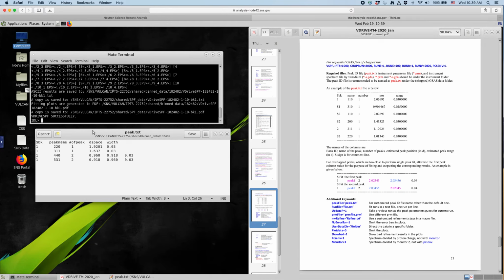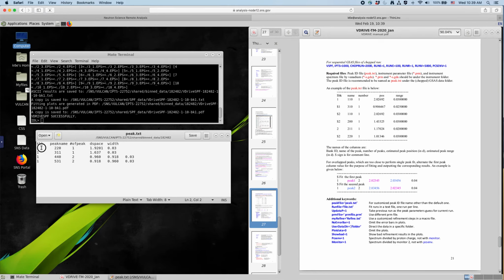You can change the fit settings by adding the dollar character to comment out the fit in the next one, and save it and redo the fitting. It will take the new settings and do the fitting again.